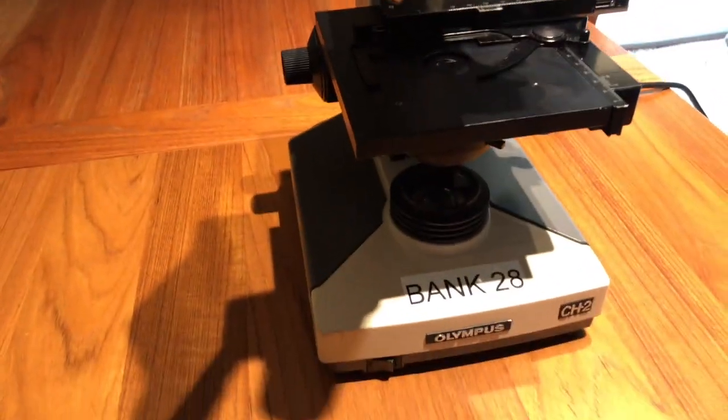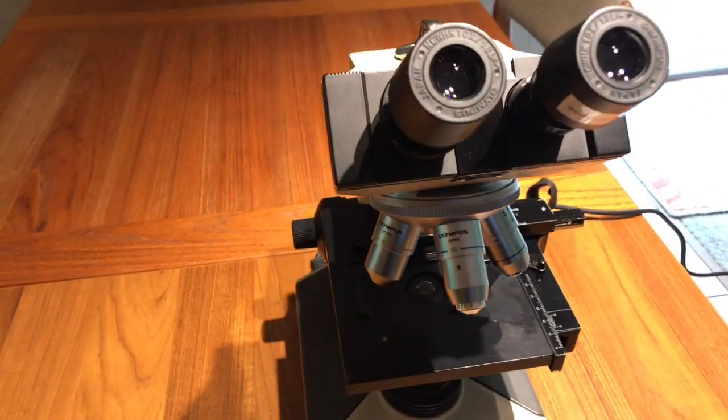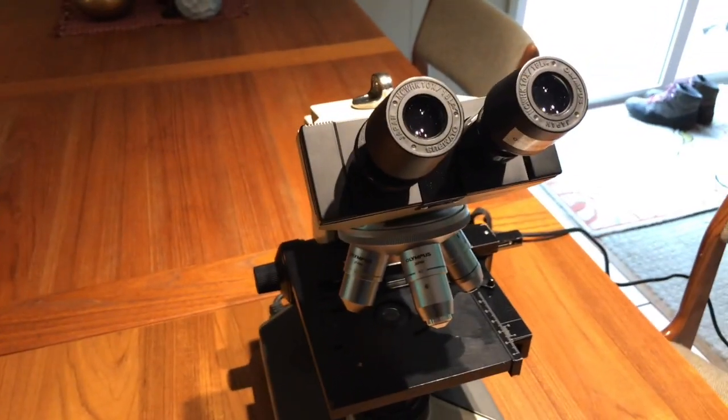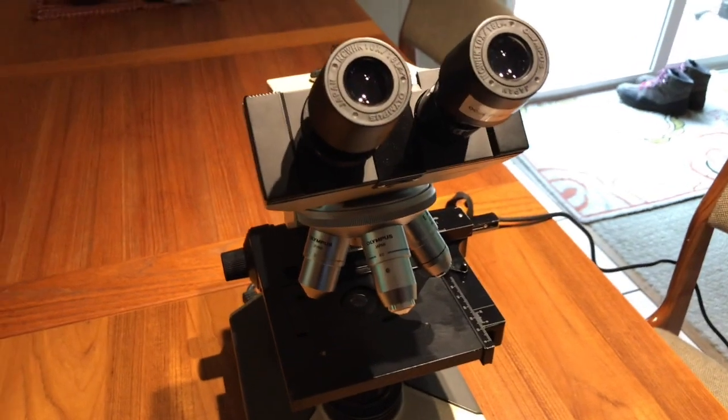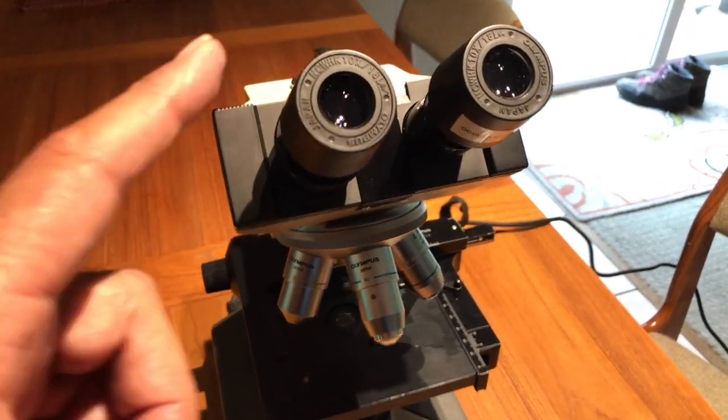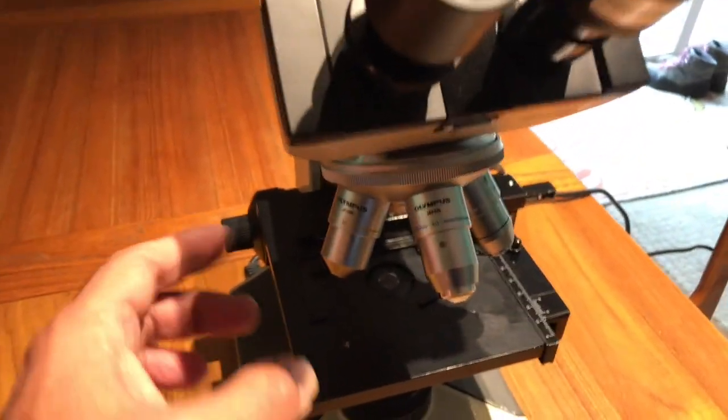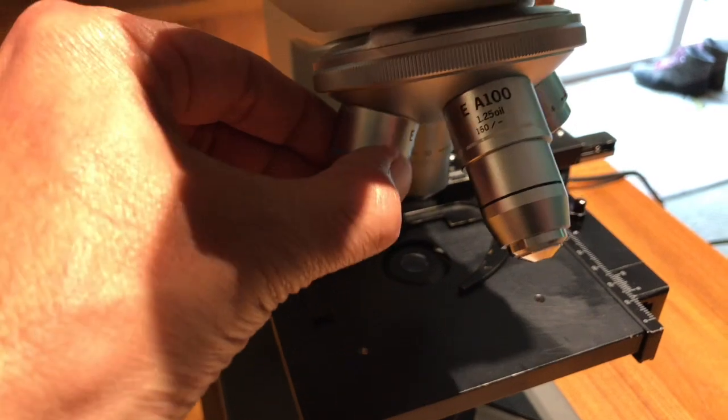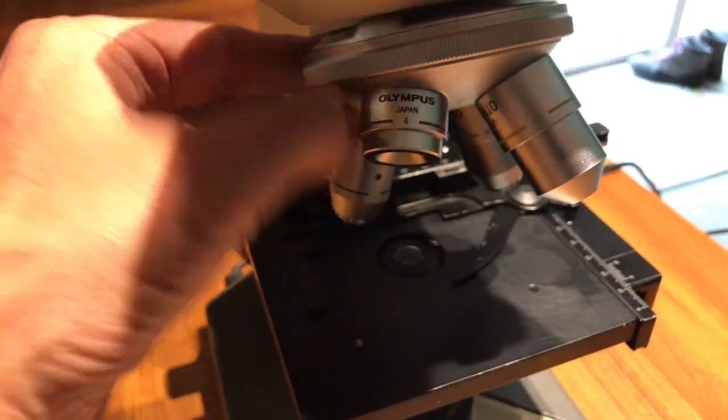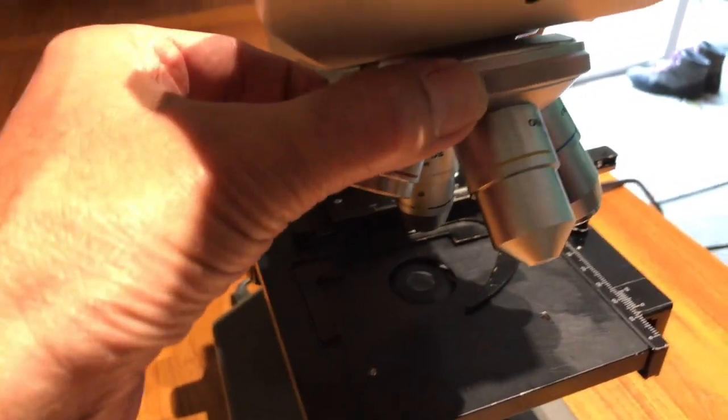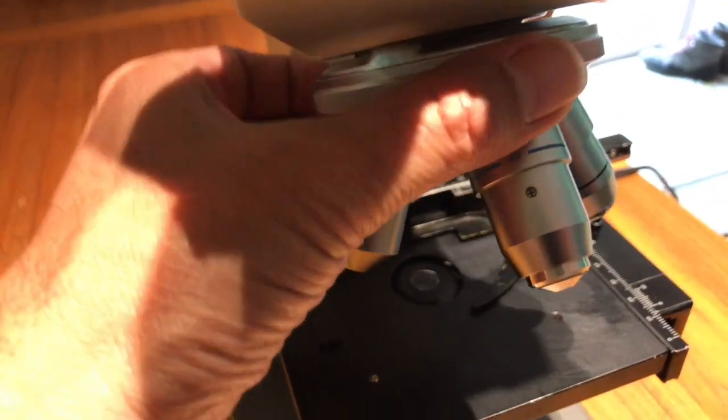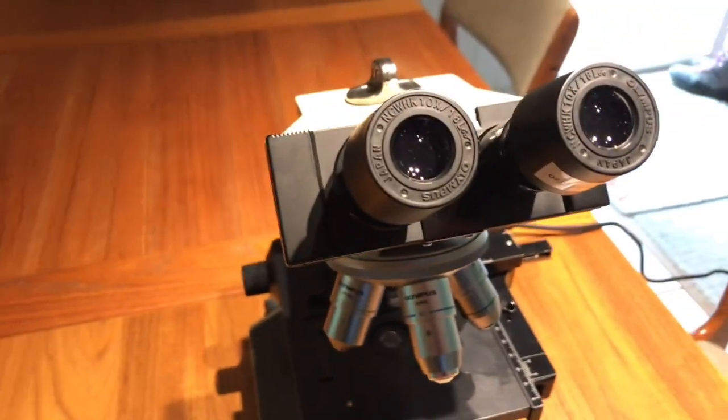We call these compound scopes, and they're called compound because they have two sets of lenses: the eyepieces which are on the top, and we have two of them, and then a series of objectives with different magnifications. We have four total on this one.